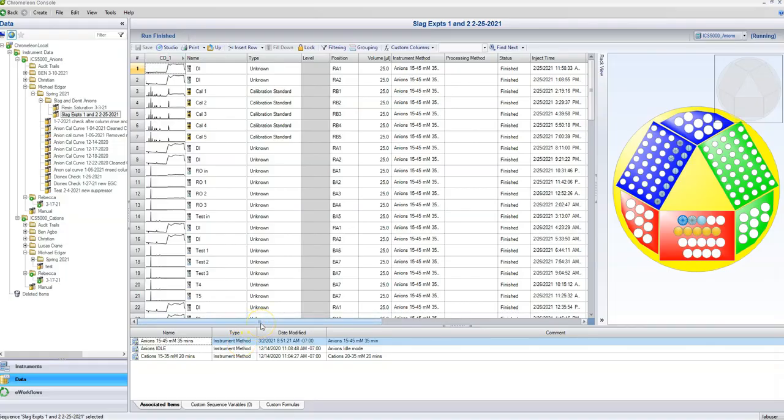All right, so congratulations on making it this far. Now let's get our data off of the IC, the moment we have all finally been waiting for. So obviously we're going to start by going into our file and finding our finished run. I'm going to be using this one as an example because we have all of the data and there is no processing method for it. Now, we can double click on any of these chromatograms and it'll open the data analysis software.